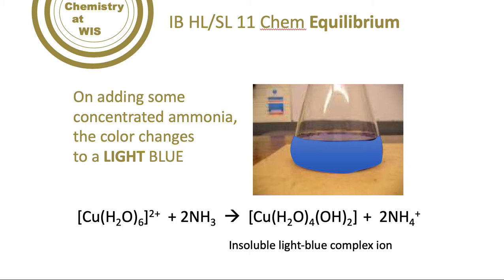Now, if we add concentrated ammonia to the solution, we actually get a color change to light blue, and that is due to really the formation of copper-2 hydroxide.